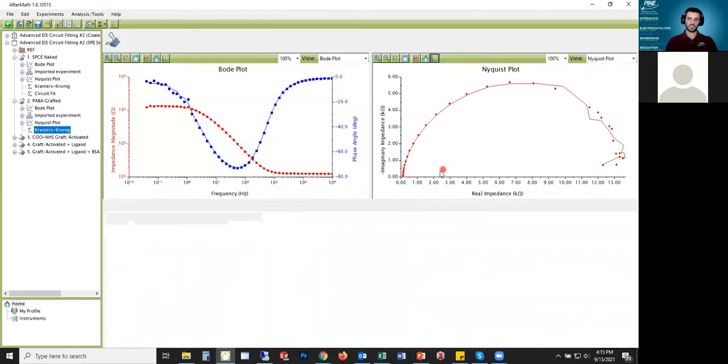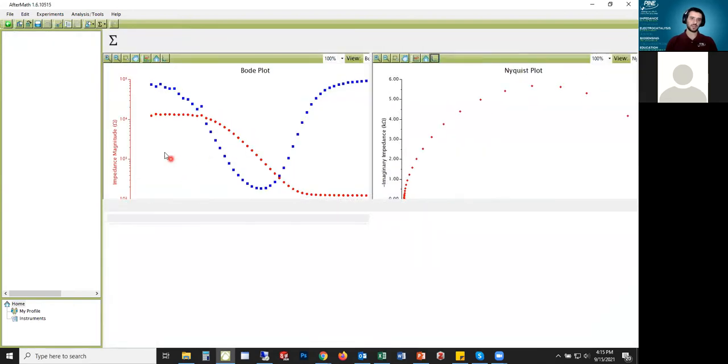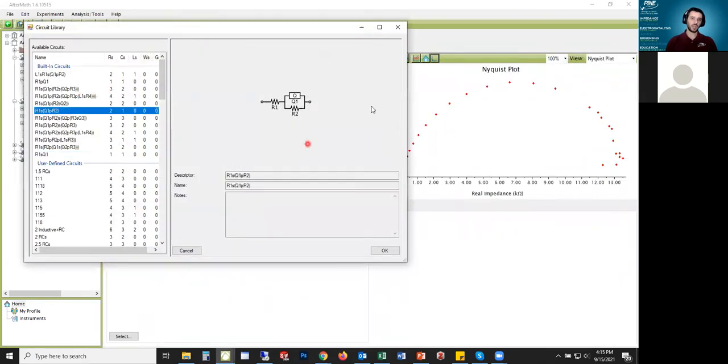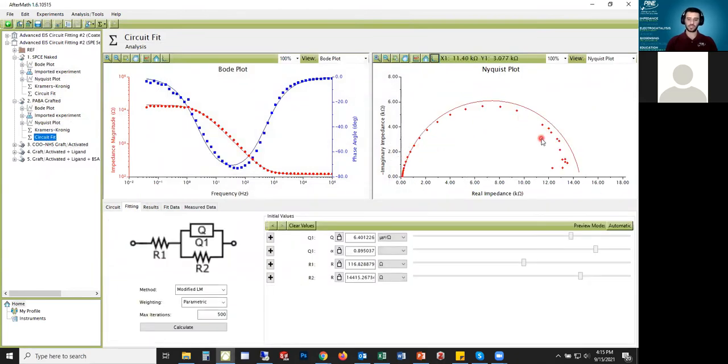The PABA grafted data was mostly just a simple Randalls element. In fact, it just looks kind of like a single Randalls element and then there was a little bit of noise at low frequency for sure. You see that the Kramers-Kronig doesn't fit this portion too well so I wouldn't expect the circuit fit to really fit the end very well either, but it just kind of looks like a simple Randalls element, almost like one semicircle, and so this is probably good enough honestly for this fit.